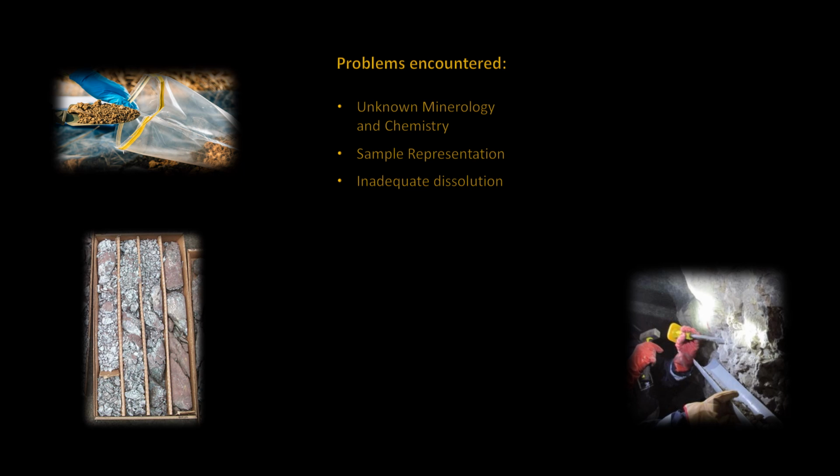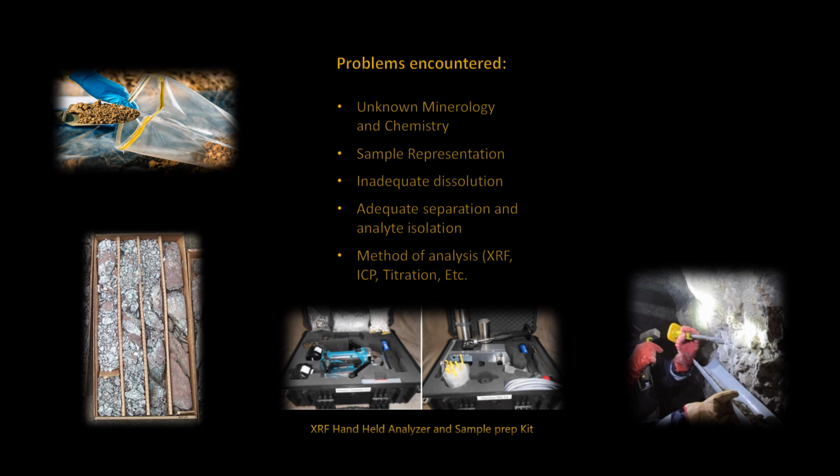Chances are that you will be separating your samples into multiple samples for quantitative and qualitative analysis, as was shown in parts 1 to 4 of this series. Will your samples be adequate in regards to separation and isolation of the analyte in question, that is, of interest? If you are going to be using instrumentation for analysis, then all your samples will need to be in solution. The only exception is with XRD and XRF analysis. These samples are usually compressed into hard disks or fused into glassy ones.